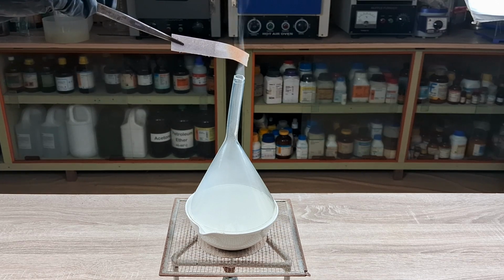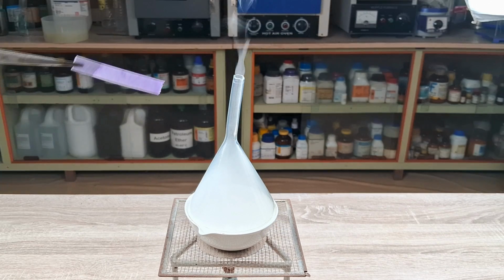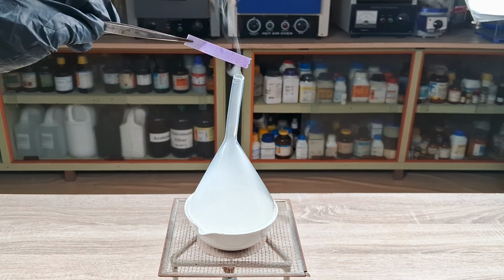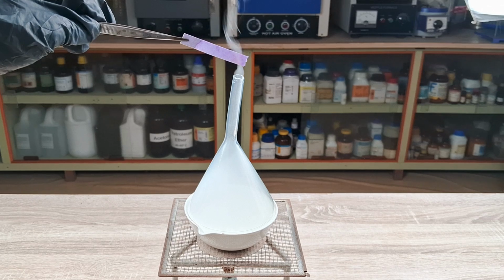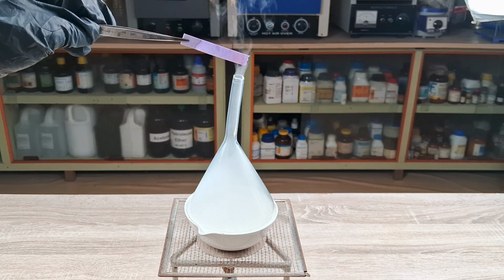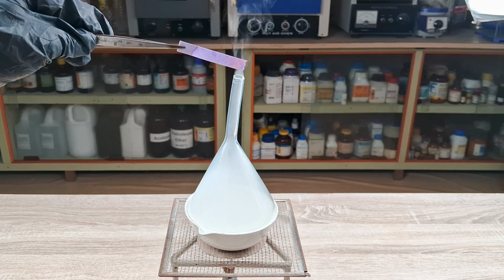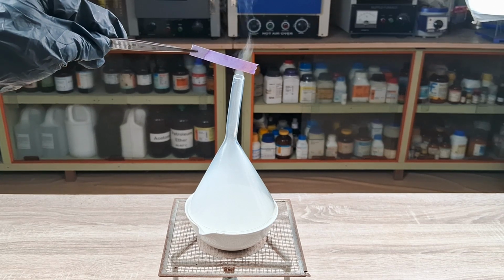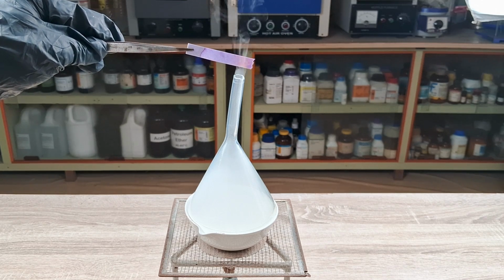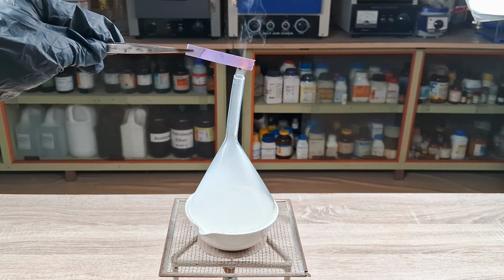Blue litmus paper turns red in the presence of an acid. In our test, we saw that the blue litmus also turned red as it came in contact with the white fumes. The only plausible explanation for this, considering the circumstance, is that the white fumes contained hydrogen chloride gas, which is highly acidic and was able to turn the blue litmus red.